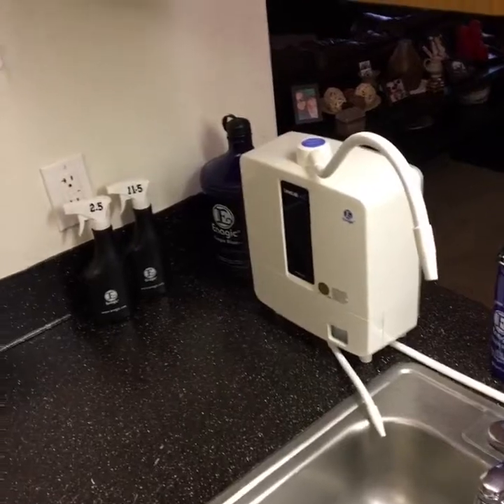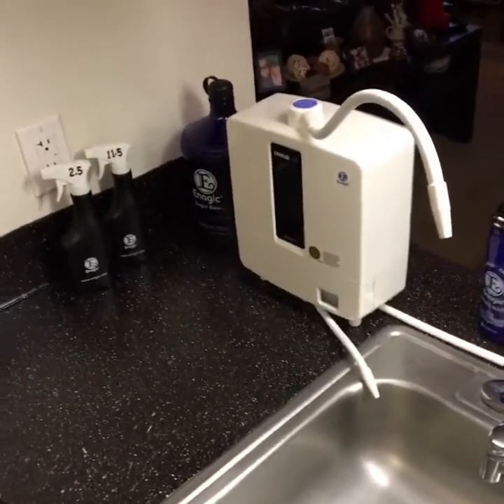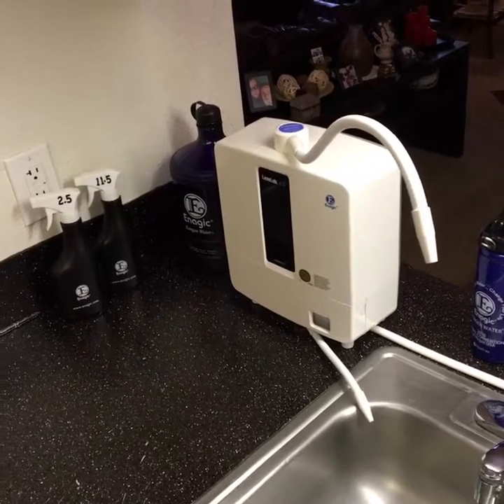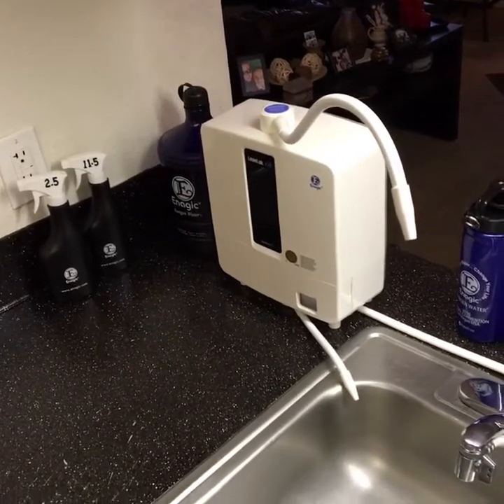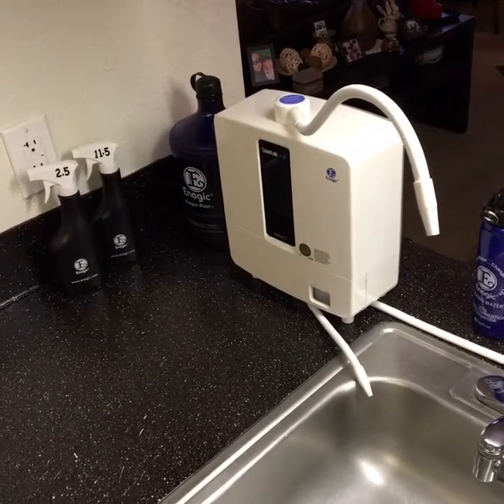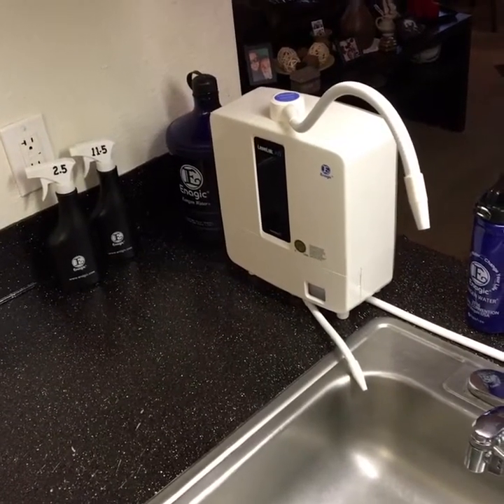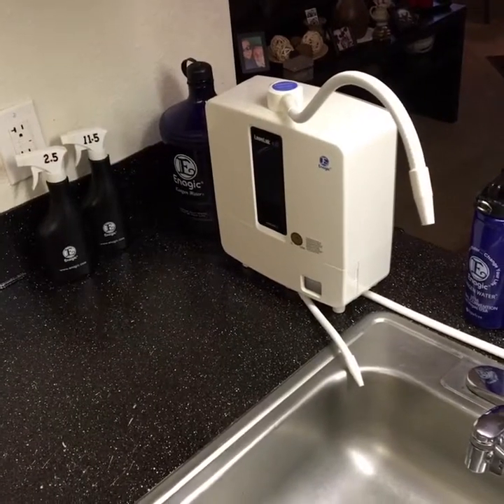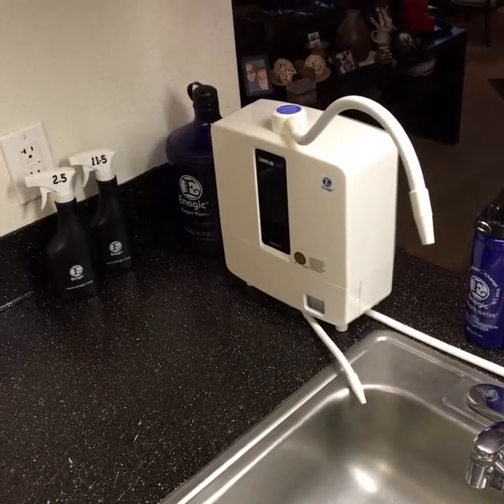I used to use Pinpoint, and Pinpoint's a great brand, very good. But constant calibrations with it — you pay money for the calibration fluid — it gets a little pricey and annoying. I find the Milwaukee brand ORP meters to be a lot more simple, very powerful, and an excellent name brand.